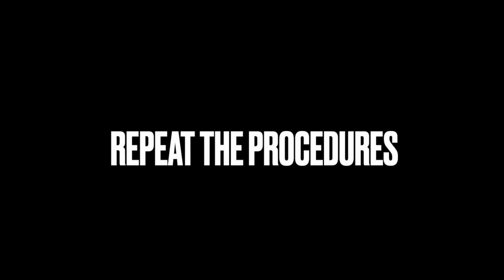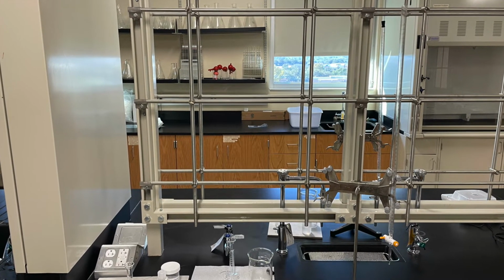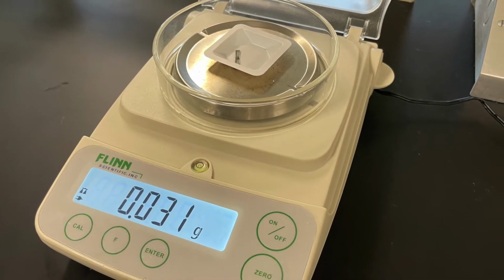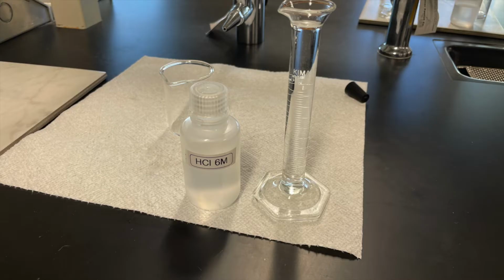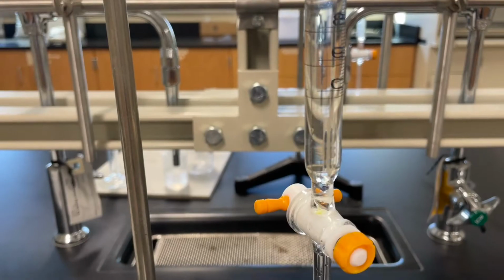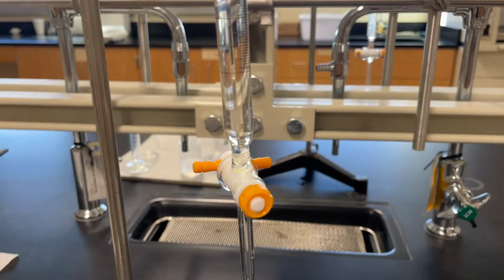And then, as always, we're going to repeat the procedure a second time, just to make sure that our results aren't out of line and that they are pretty accurate and reliable. So we'll repeat the procedures one more time and be able to record the data as you progress through this last segment here of the video.